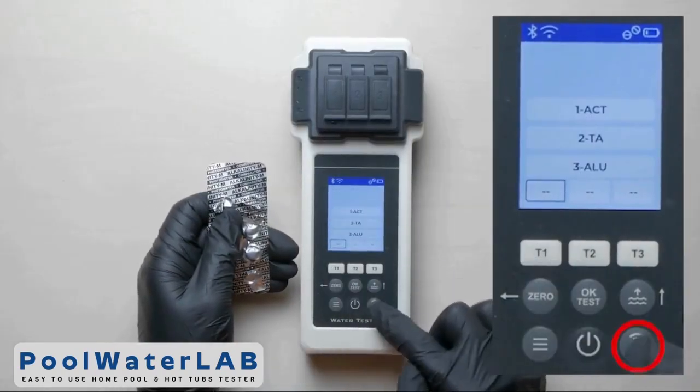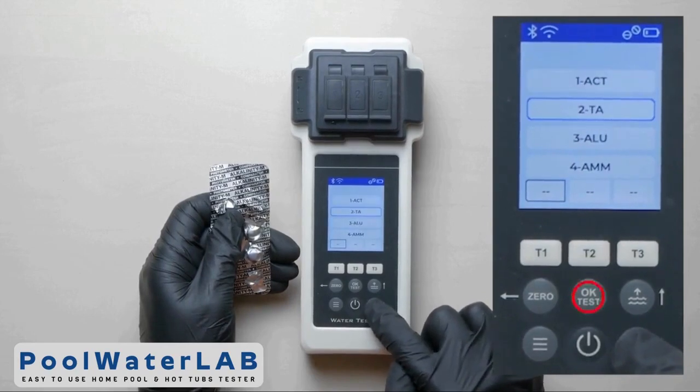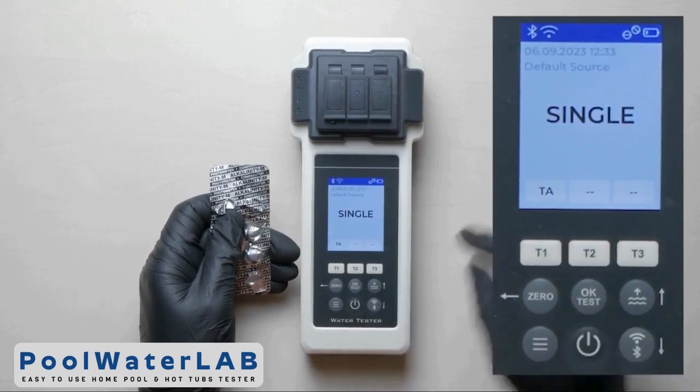Press the T1 button to go to the menu. Use the up and down buttons to select the desired parameter. Click OK Test.